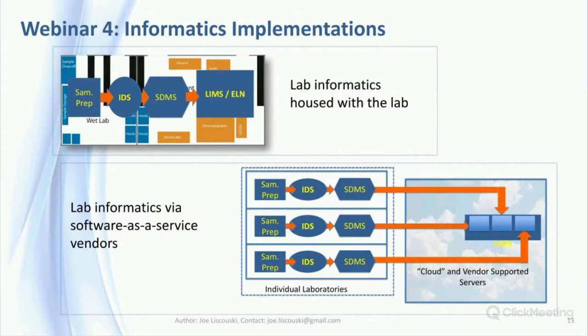These topics are becoming increasingly important as cloud technologies become more prevalent. This session will begin looking at the roles that information technology support groups can play in this work. Among the points that will be covered are the planning for multiple laboratory use of database systems, the use of local and cloud-based computing models, and how IT groups can play a role in that work.